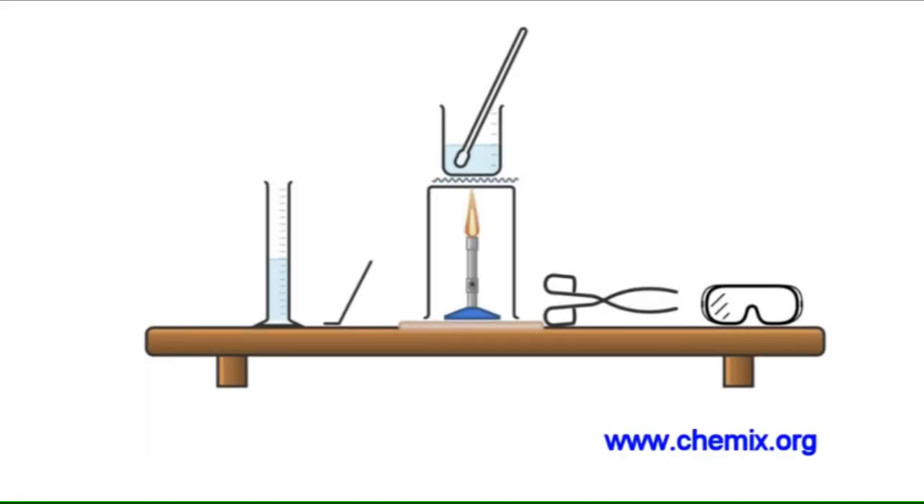Stage one: preparation of a soluble salt, copper sulphate. I will use black copper oxide powder and sulphuric acid. We need to be confident with the names of the equipment and the procedure. The equipment: heatproof mat, tripod, gauze, Bunsen burner, a 100ml beaker, glass rod, spatula, safety glasses, 250ml measuring cylinder, and tongs.